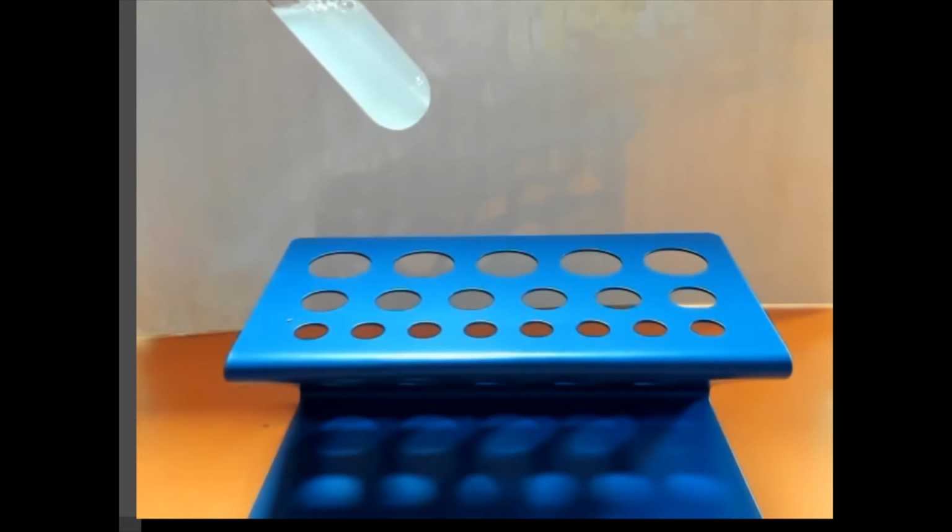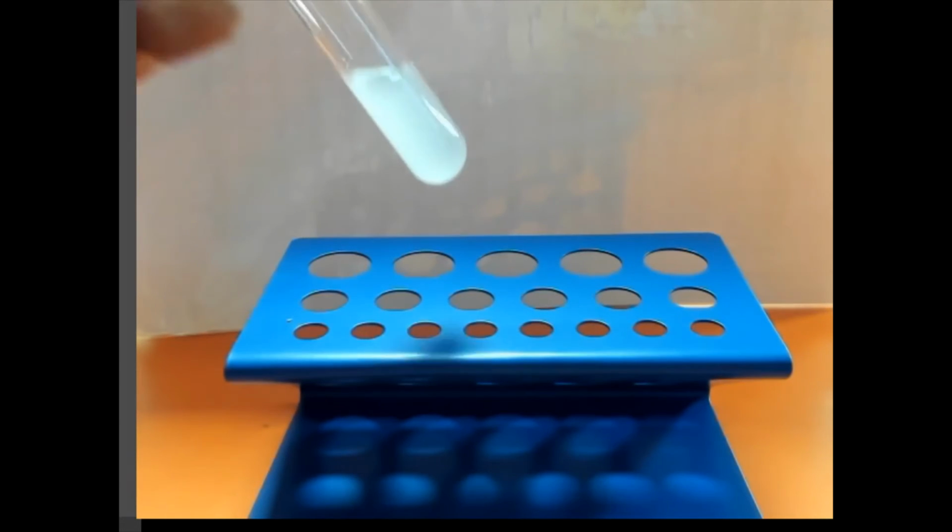And there we go. That's how we test for carbon dioxide. We use lime water, which is aqueous calcium hydroxide, and there's a color change from colorless to cloudy white.